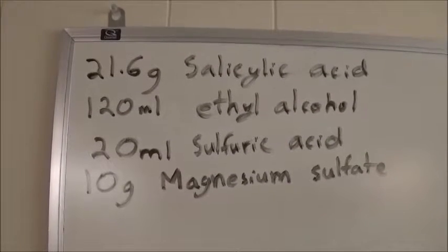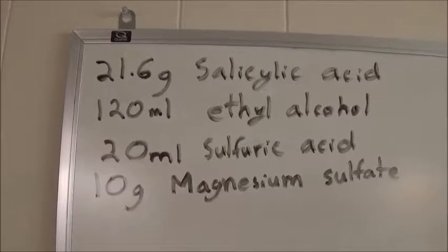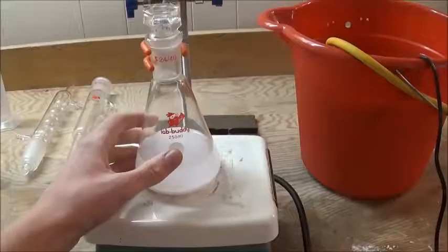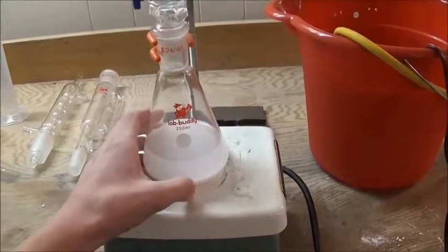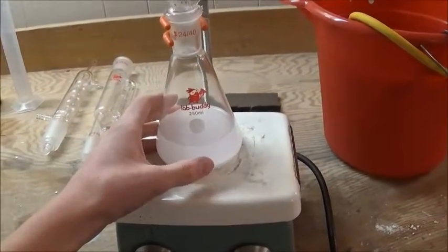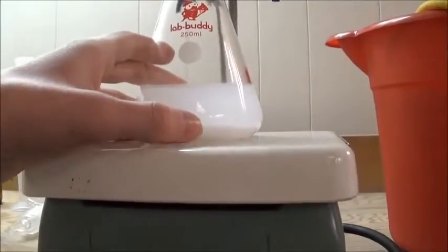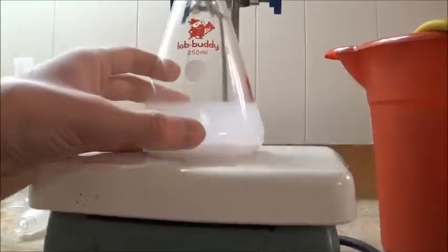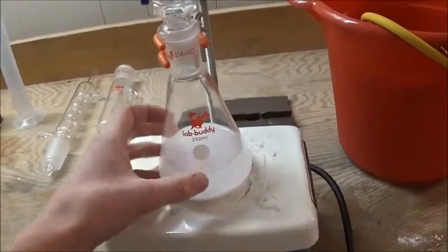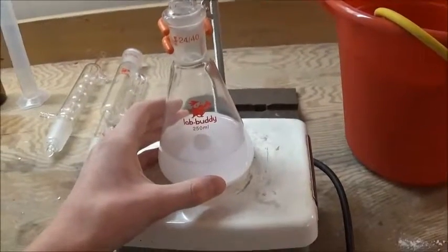In this reaction only about 9 milliliters of the ethanol will be consumed. The rest is to fill up the Soxhlet extractor so it can be continuously dried and to serve as a solvent. In the flask I have placed 21.6 grams of salicylic acid and 120 milliliters of ethanol. You can see it's very cloudy from the presence of magnesium sulfate in the ethanol, since I didn't distill it after drying. But this won't be a problem because there will be magnesium sulfate in the extractor anyway, and I'm going to distill the ethyl salicylate to purify it.